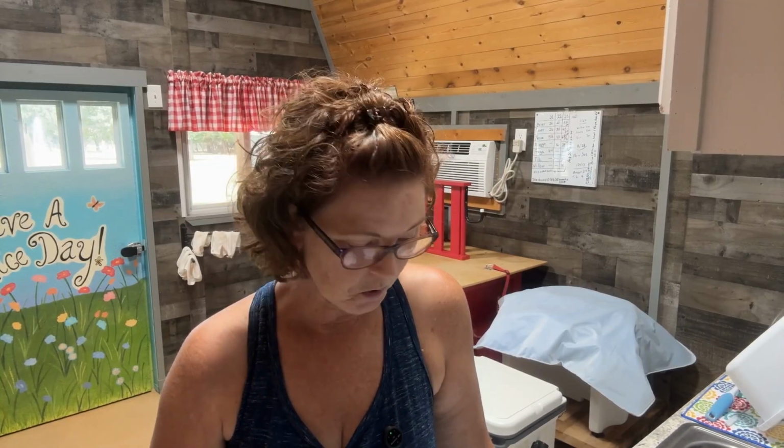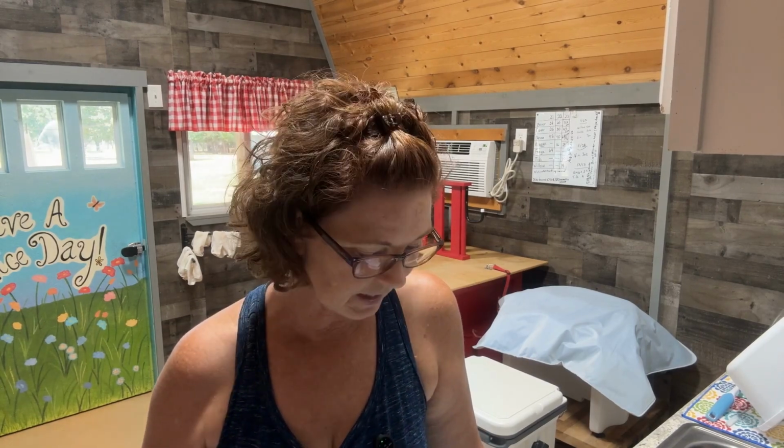Hello again. It is the next day and I have pulled my little petri dish out of the incubator, and we have good and bad news. So the good news is Nessa grew nothing, which is what I kind of anticipated was probably going to happen. So I don't have to get my vet involved and all that business. Most likely what is going on with her is what I suspected.